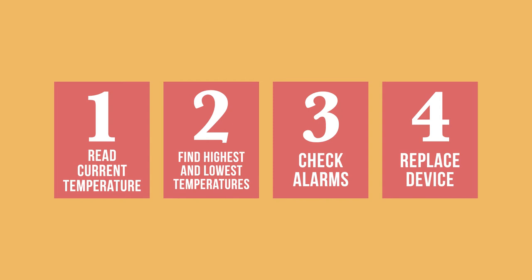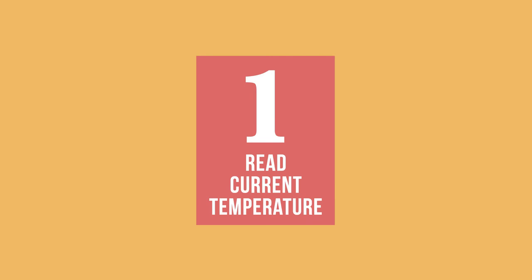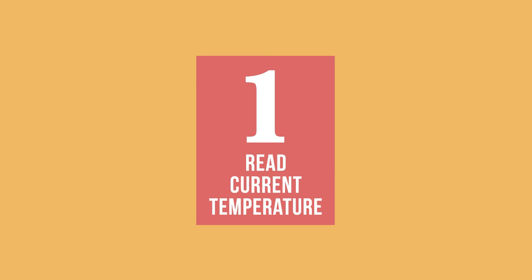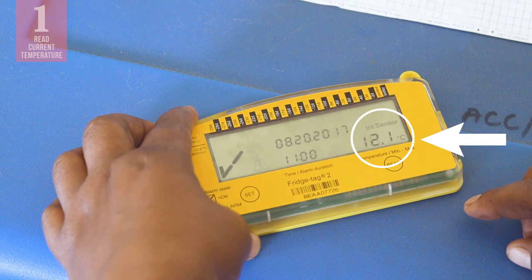So, let us start with the first of these tasks: reading the current temperature on your fridge tag. This is a fridge tag device. To find the current refrigerator temperature, you look here, on the right side of the display.